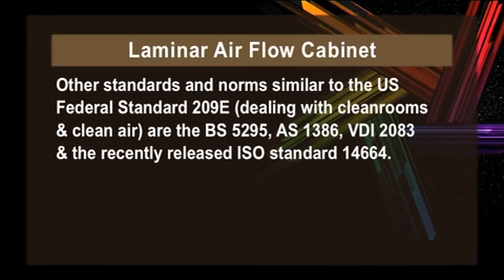Other standards and norms similar to the US federal standard 209E dealing with clean rooms and clean air are the BS 5295, AS 1386, VDI 2083 and the recently released ISO standard 14664.